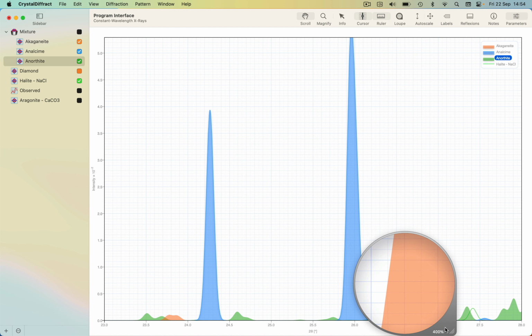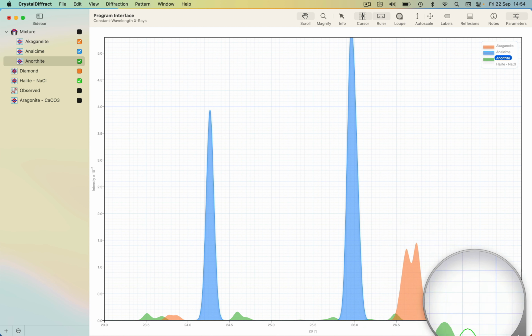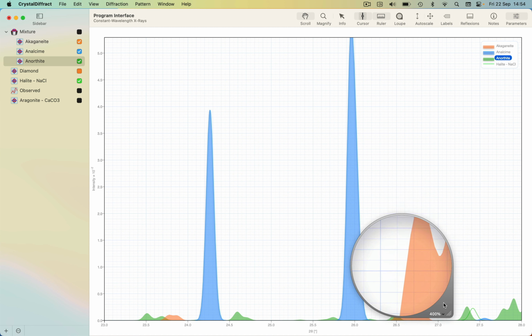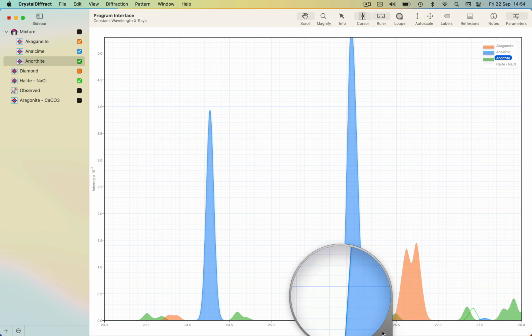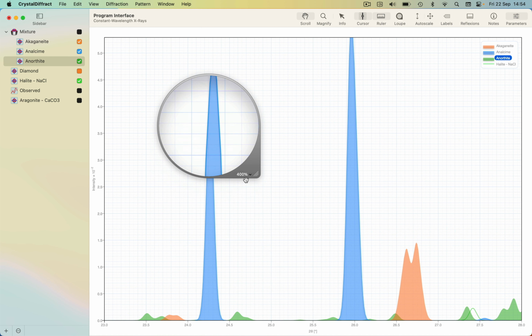The loupe allows you to magnify an area of the plot. And this is useful when working with a small screen, as it allows you to look at areas at high resolution without having to resize. You can set the magnification in the loupe using its drop-down menu.